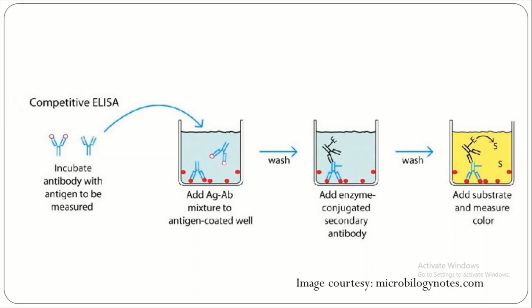So in the pictorial representation, you see, first you incubate the antibody with the antigen to be measured. So you add this antigen-antibody mixture to the antigen-coated well. Here the antigen is already coated. You are adding both free antibody as well as the antigen-coated antibody.